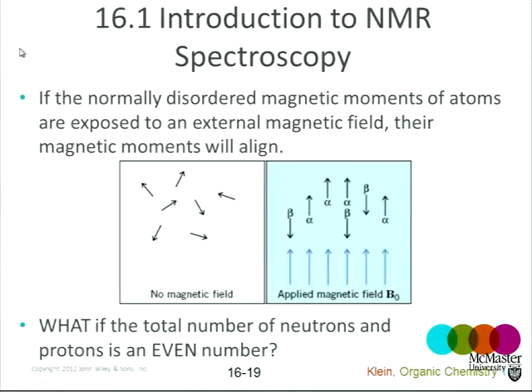So normally those little magnetic fields that are created by the individual nuclei are random, but when we put them in a magnetic field and we go to the quantum world, the nuclei line up. We have a quantized situation here. They have to line up rather like a magnet. You can line it up. If you let a magnet go, its north pole points to the north pole of the Earth. There's a second state where I can turn it round and the north pole points to the south pole. And if you let that go in that higher energy state, what happens? The magnet turns around spontaneously.